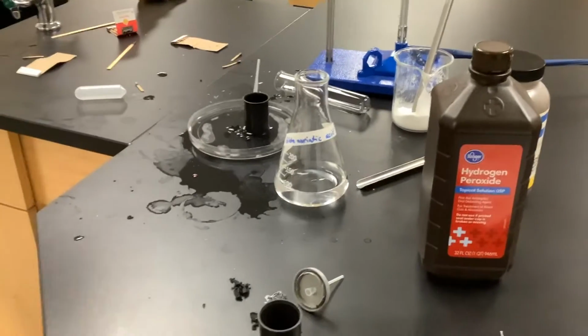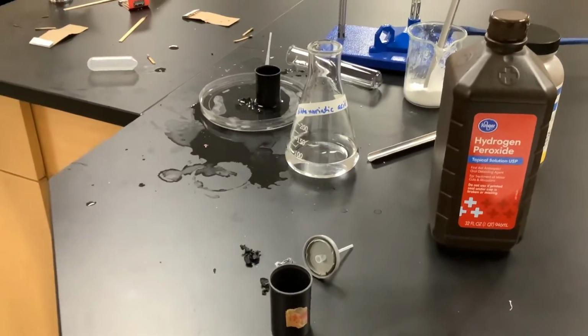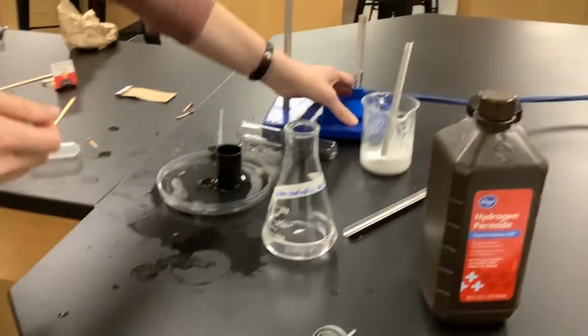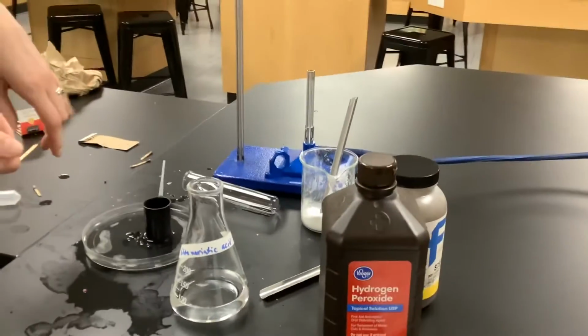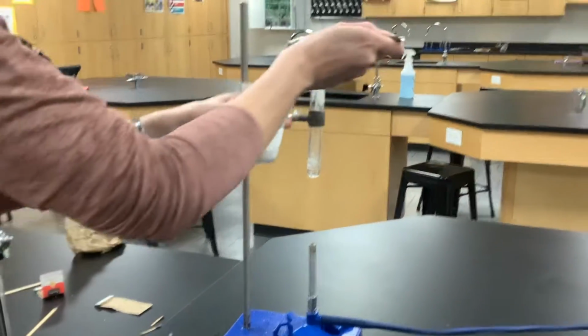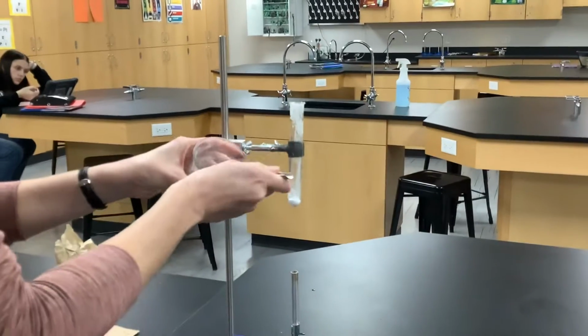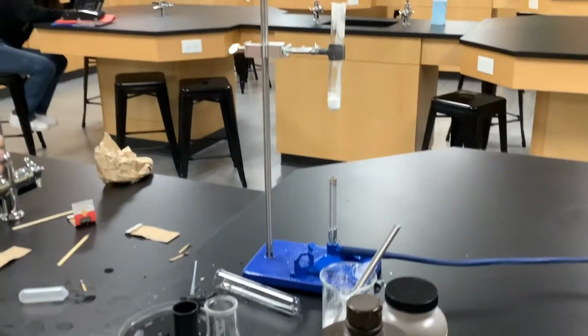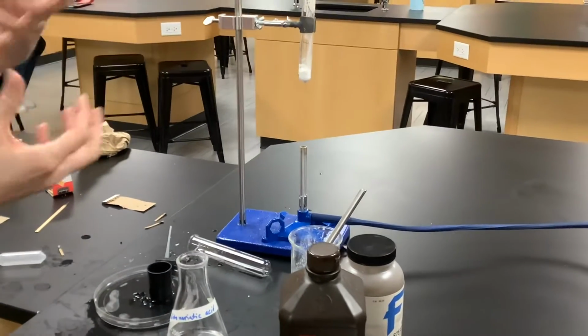In one of the reactions that we do, we are gonna produce bubbles. There's gonna be a solution, and hydrogen gas is gonna bubble out of that, so we're gonna see it. The first one we're gonna do here is the decomposition of baking soda. So I'm gonna put baking soda in here. The decomposition reaction means that we're starting with some reactant, and that reactant during the chemical reaction is going to break apart into component parts.